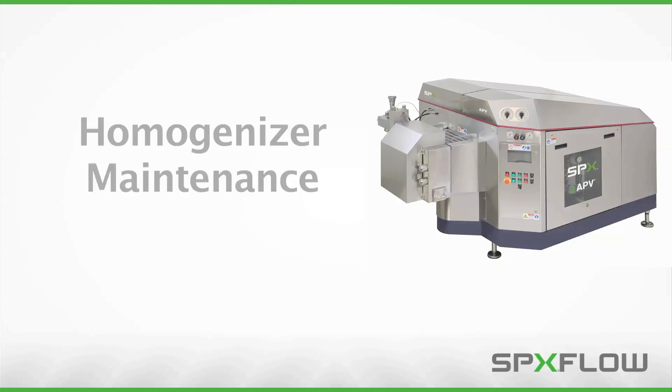From time to time, your SPXflow APV Gallen homogenizer requires routine maintenance to ensure peak operating efficiency. This video will teach you the service procedures necessary for replacing the packing materials, as well as removal, inspection, and replacement of your homogenizer's check valves.